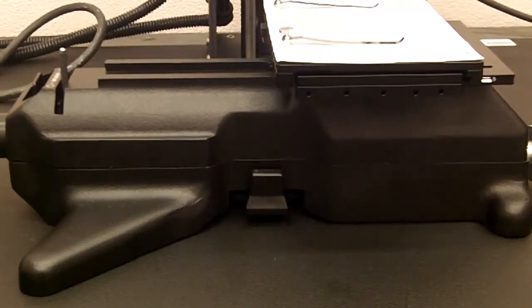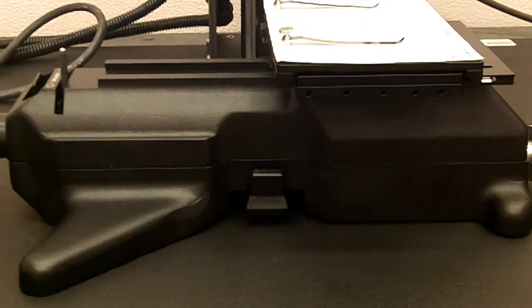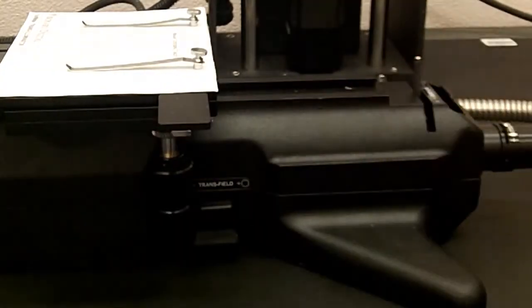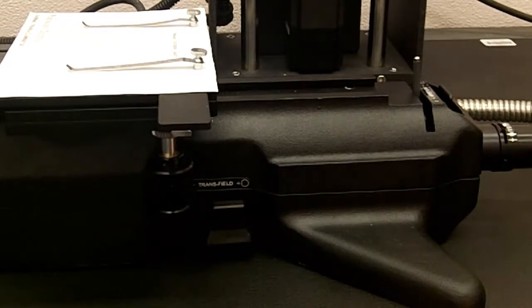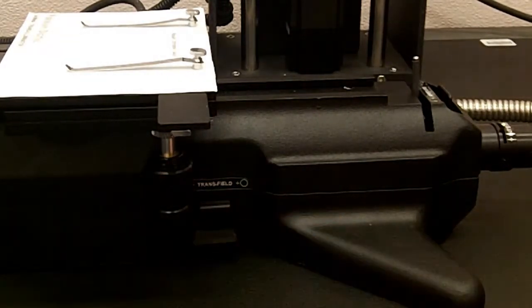In the center bottom portion of the SolMate is the transfield, and just generally keep it in the center. The actual controls are in the back. So here are the controls in the back with the SolMate turned around. It's more open to the right and more closed to the left. So generally just keep it in the center.